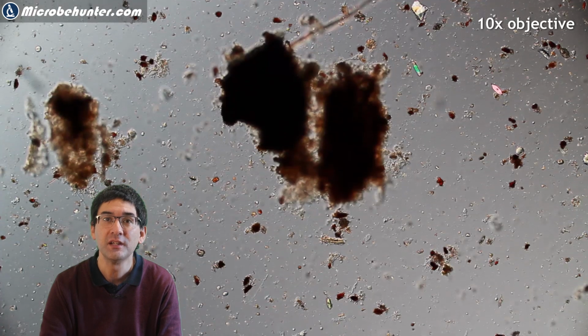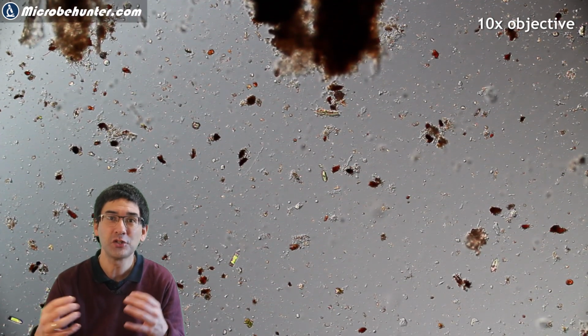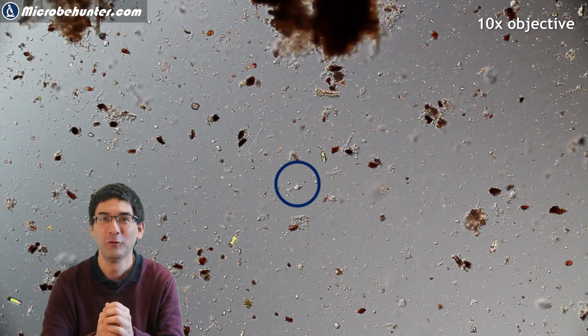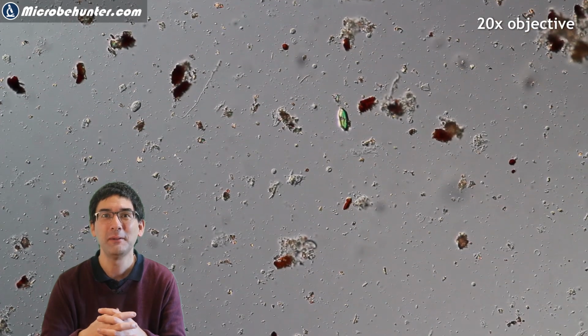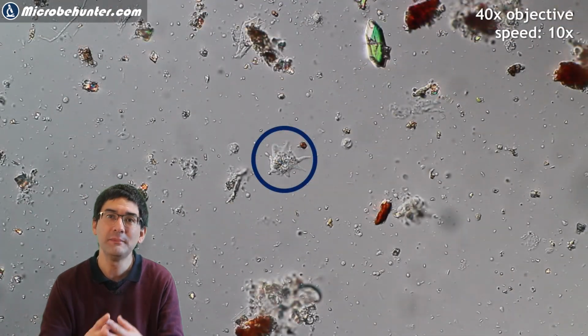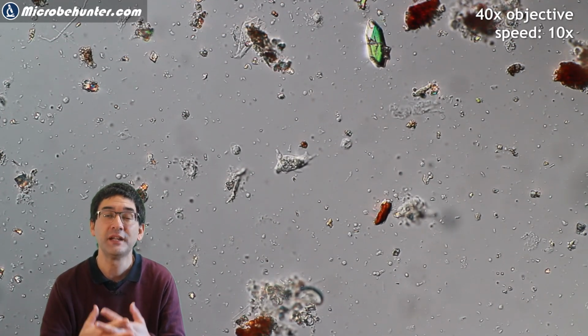And this is what you're gonna see. It looks like nothing really. It's a complete mess, lots of debris, but right in the middle there is an amoeba, and you might have overlooked it, but that's what I'm saying is you have to be very careful and you have to be very patient. But right in the middle you have an amoeba, and especially under time lapse, if you speed it up a little bit, so 5 to 10 times, then you are also able to see that it actually moves, and this makes it much easier for you to identify them.